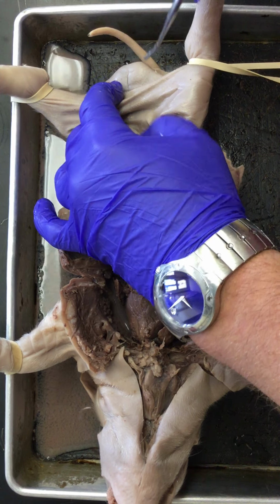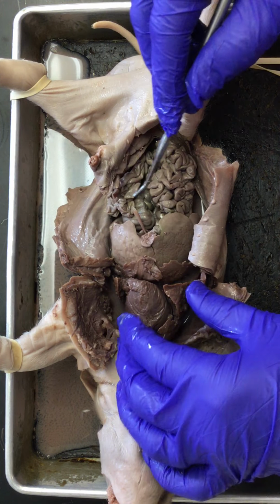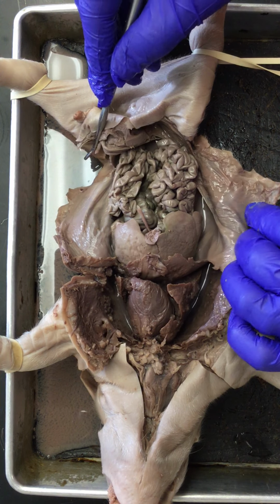Let's see, I think we've already externally sexed this pig, so there we are. Internal anatomy of a pig.